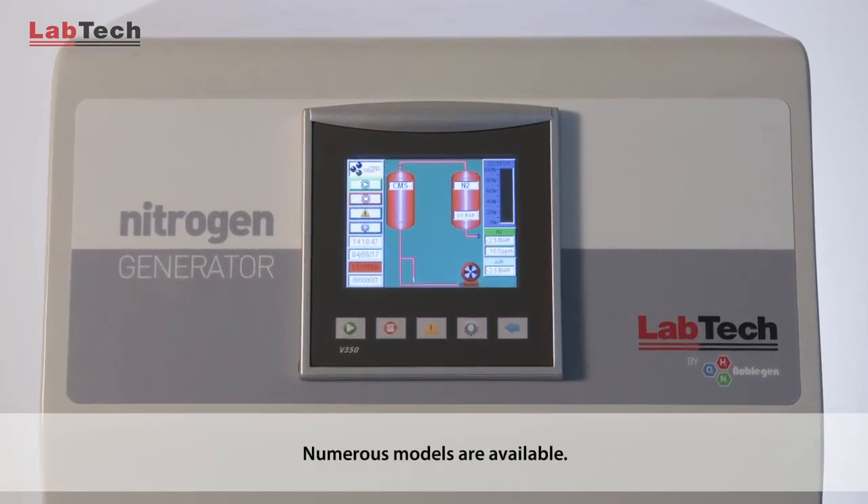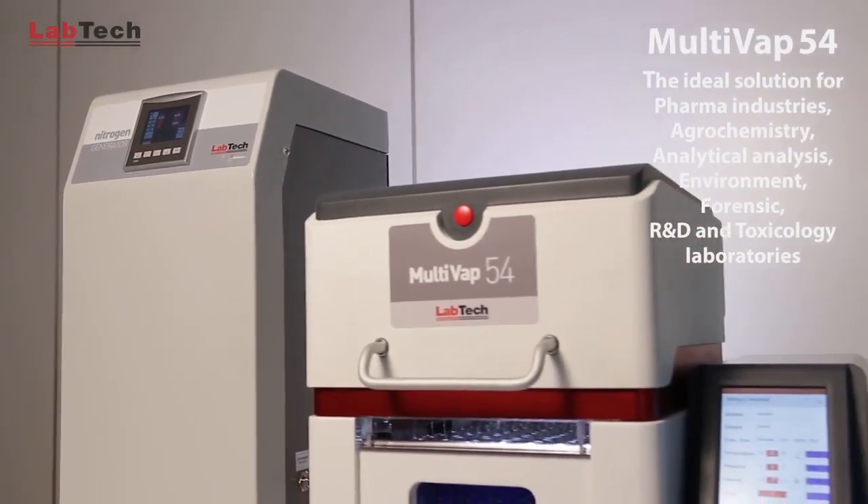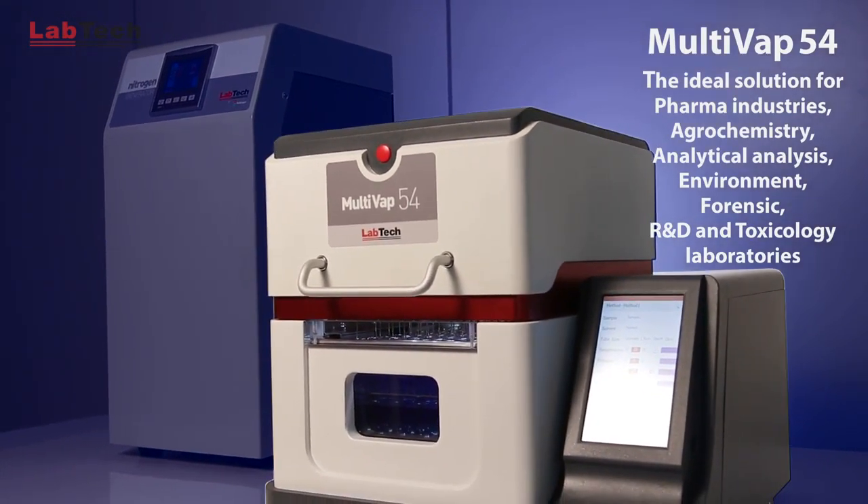Numerous models are available. The Labtech Multivap 54 is the ideal solution for pharma industries, agrochemistry, analytical analysis, environment, forensic, R&D, and toxicology laboratories.